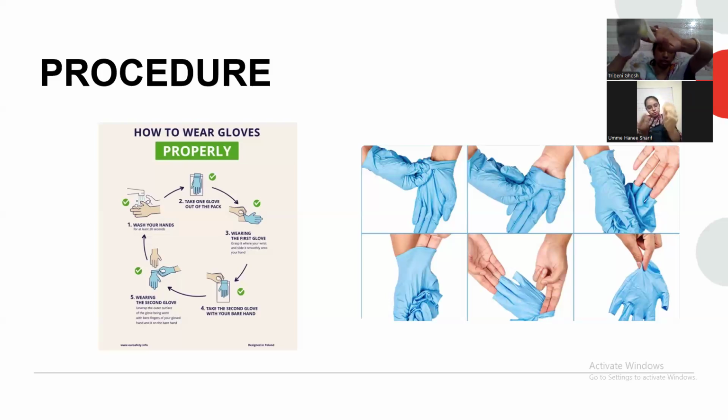Okay. Make sure you have other gloves. I think you might put it. I just dropped it. Yeah, do not drop it anywhere. Take the skin first and then drop it in the right place, like the right bins, where you're supposed to discard all your gloves.